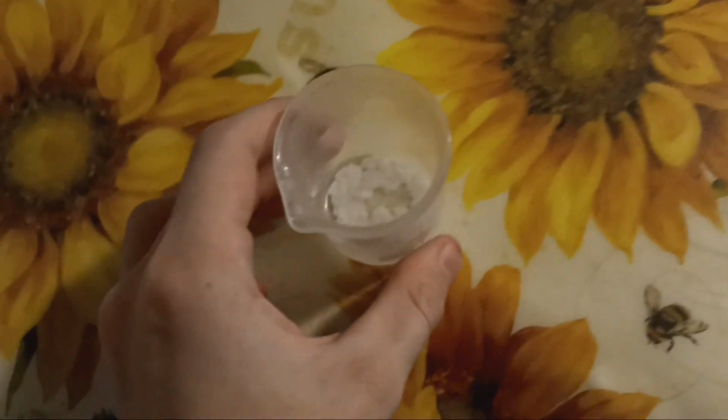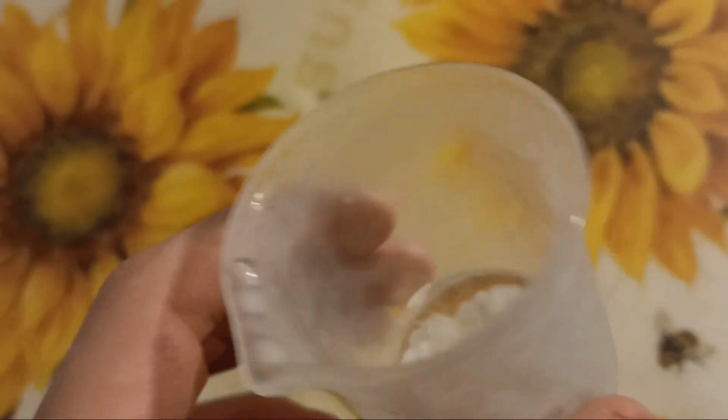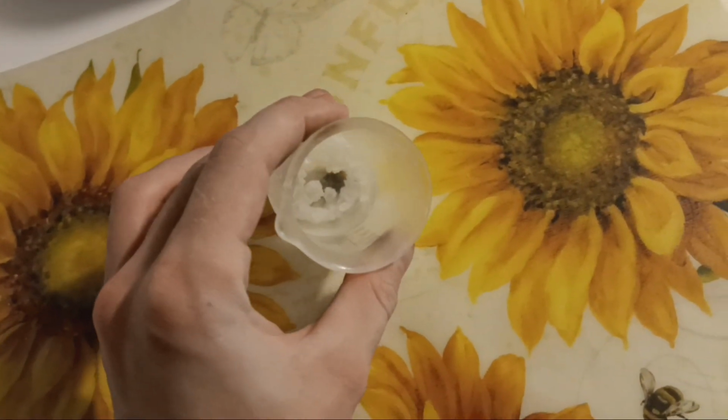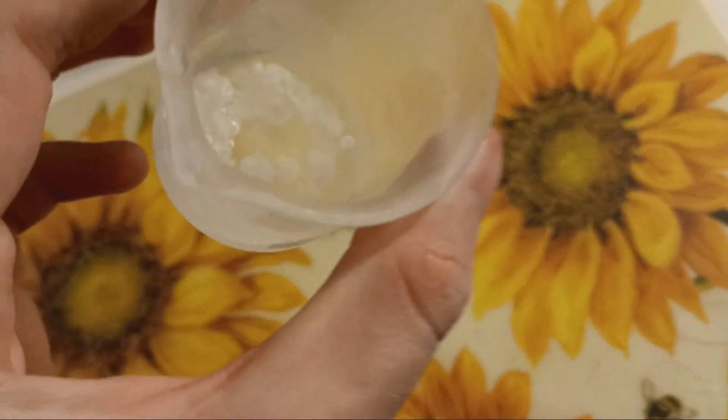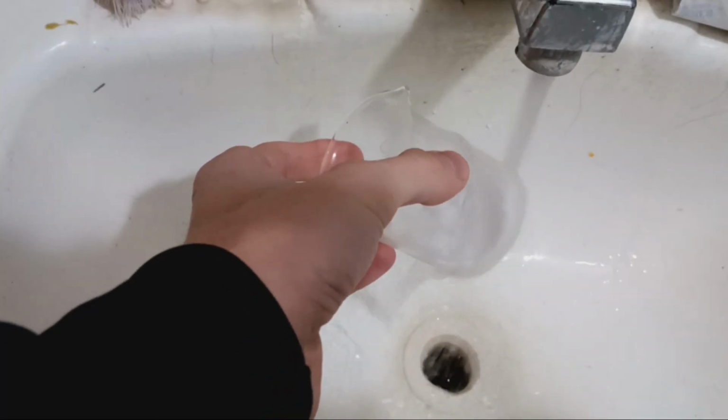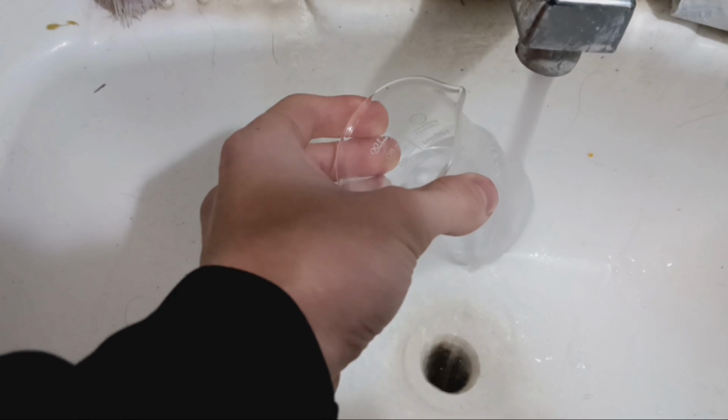This was one thing I was not expecting to work, and when it did work I was very scared. Mainly because the crystals were white, and this could either be salt, zinc oxide, or potentially sodium hydroxide, although I do not know very much about zinc oxide and whether or not it can dissolve into water. So I would like to believe it is the other two, and more than likely a mixture of both.